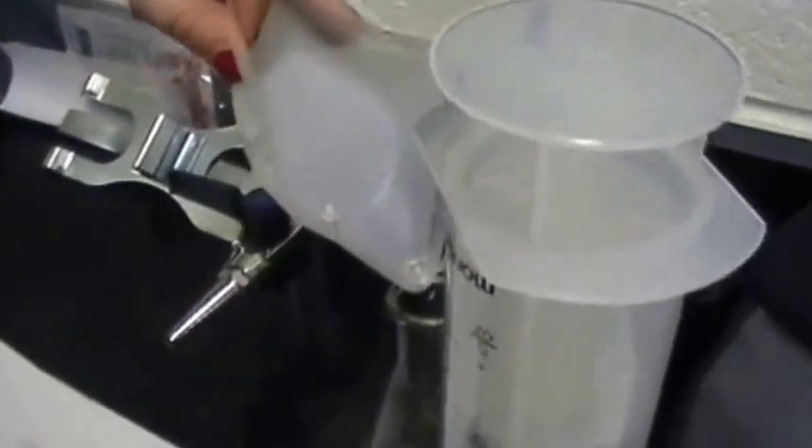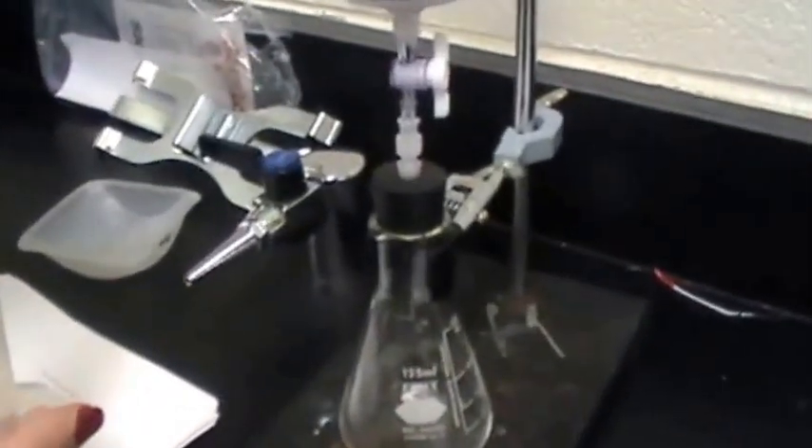We're putting 0.59 grams of calcium carbonate into our 125 milliliter flask. What we're going to do is take the 10 milliliters of hydrochloric acid and pour it in quickly, then put this apparatus back on top and measure how much gas is released from the reaction.